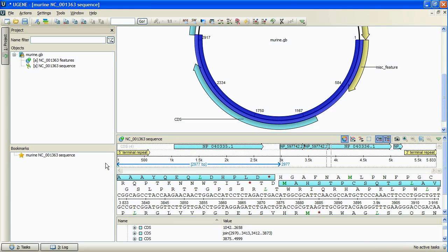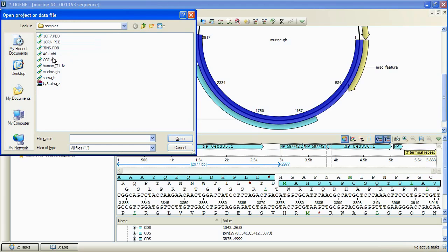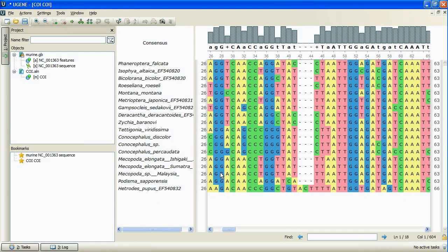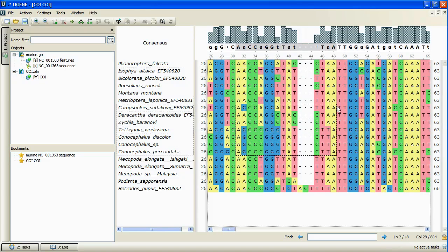We have also added a set of new features to the Multiple Sequence Alignment Editor. Let's open an alignment. In the new version, we can select any alignment region to perform editing operations.